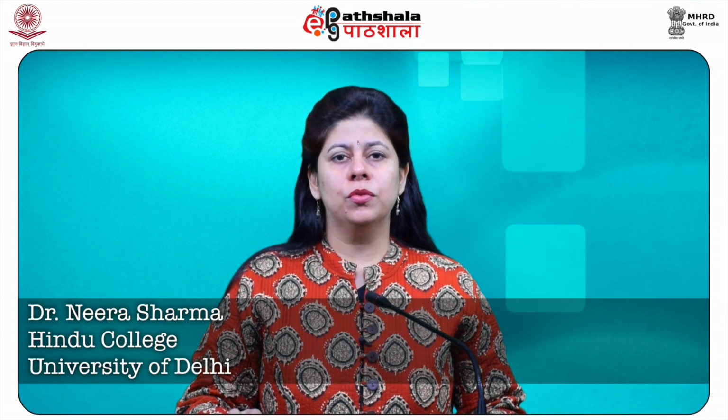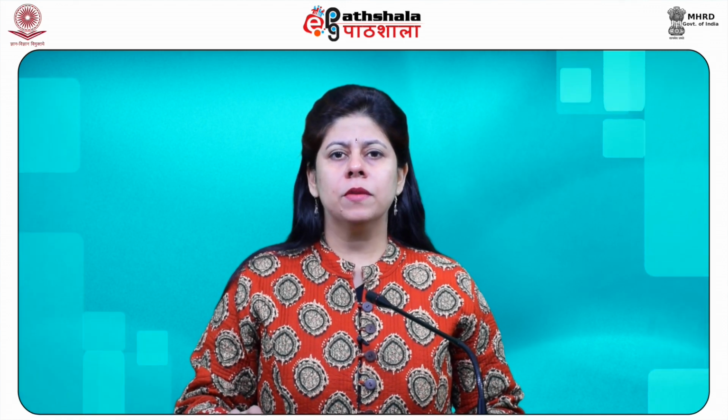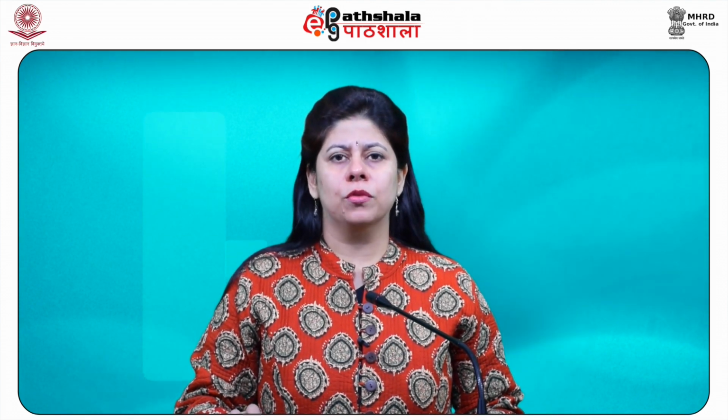After studying this module, you shall be able to know about the significance of mass spectroscopy, the basic principle and instrumentation of mass spectroscopy, the methodology and applications of mass spectroscopy.